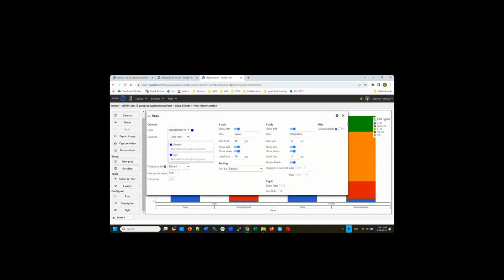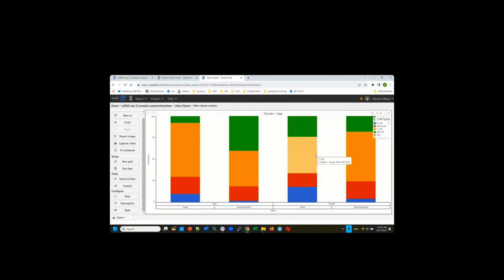It depends on which graph will help you to tell your story. So all those visualizations, one purpose is to help you understand the data. The other is to help you efficiently deliver your discovery, your message, your presentation. How you want to present to the user, tell your story.